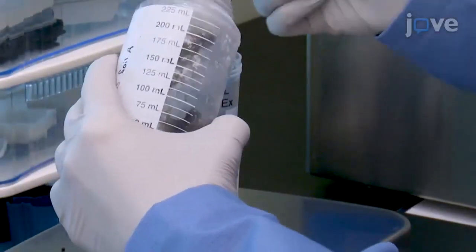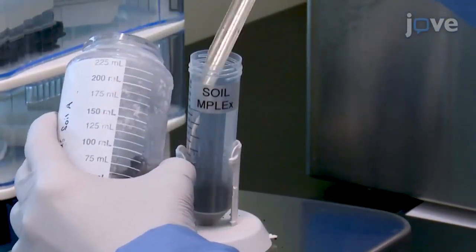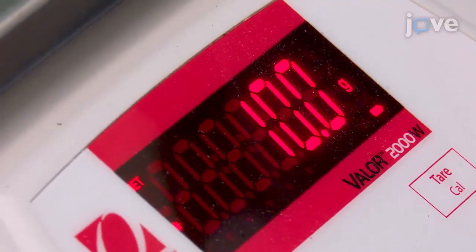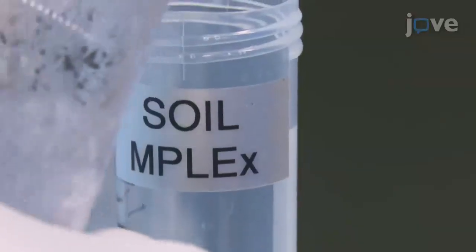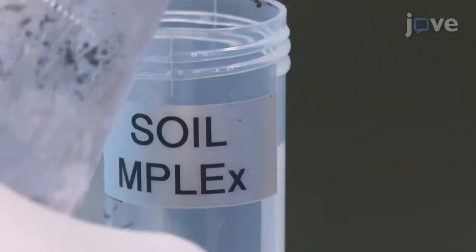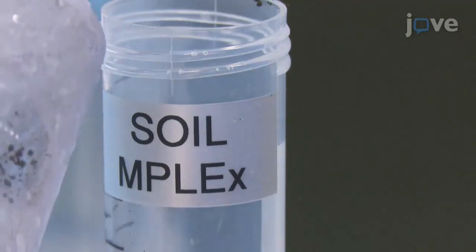To begin, for each 20-gram soil sample, weigh 10 grams into two separate 50-milliliter methanol-chloroform-compatible tubes. Use plastic tubes made from PTFE, as chloroform will leach most plastics, contaminating the samples.